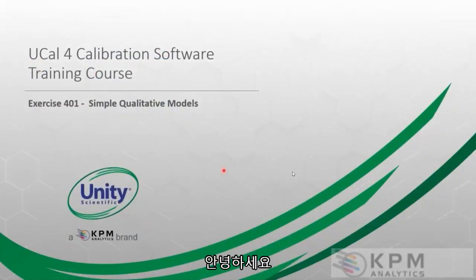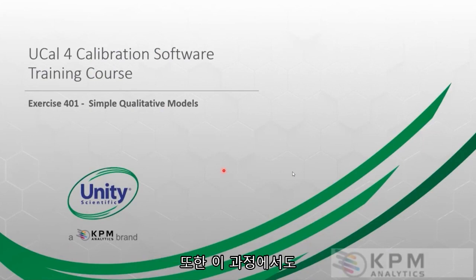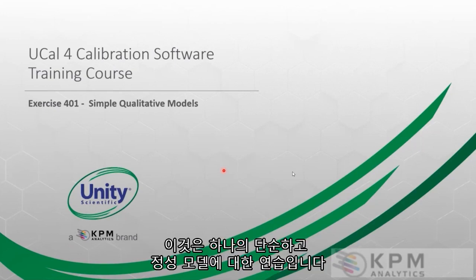Hello, and welcome to the last of our exercises about model creation. We also had the advanced sample selection in this section of the course as well. This one is exercise 401, simple qualitative models.